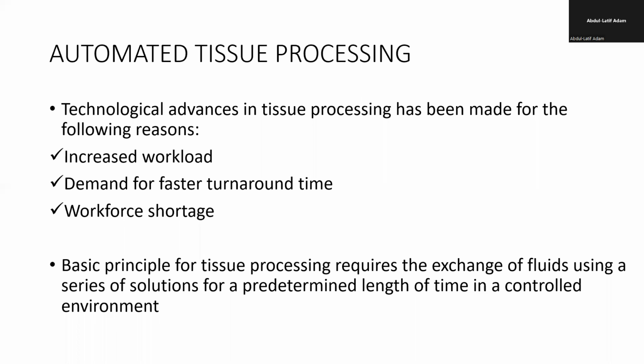If you have 20 cases, as I mentioned, in a month, you don't need automatic processing. But if you have hundreds of cases, like in a week or in a day, you receive like 50 cases, 100 cases, then you can go for an automatic processor. But if you have like 10 cases or 5, you don't need automatic. Waste of money.